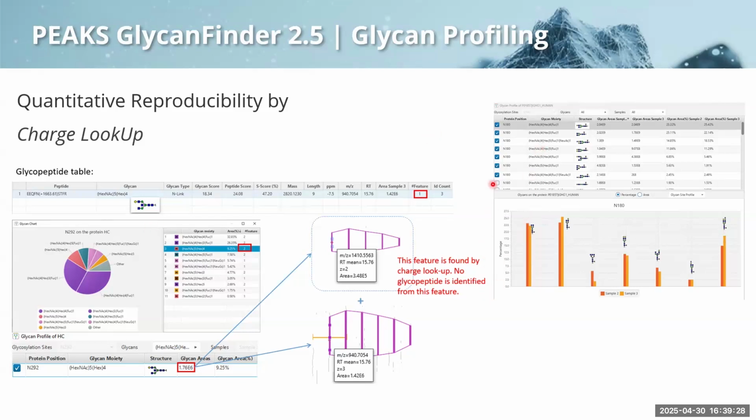And then this is an example too, if you were to look at the glycan profiling of this protein, you can look by site. In this chart, it's going to show you separately by each sample the abundance of the different glycan identities. So again, it's just by separate samples. It's the same thing I showed you before, it's just not averaged. And this is a different example.